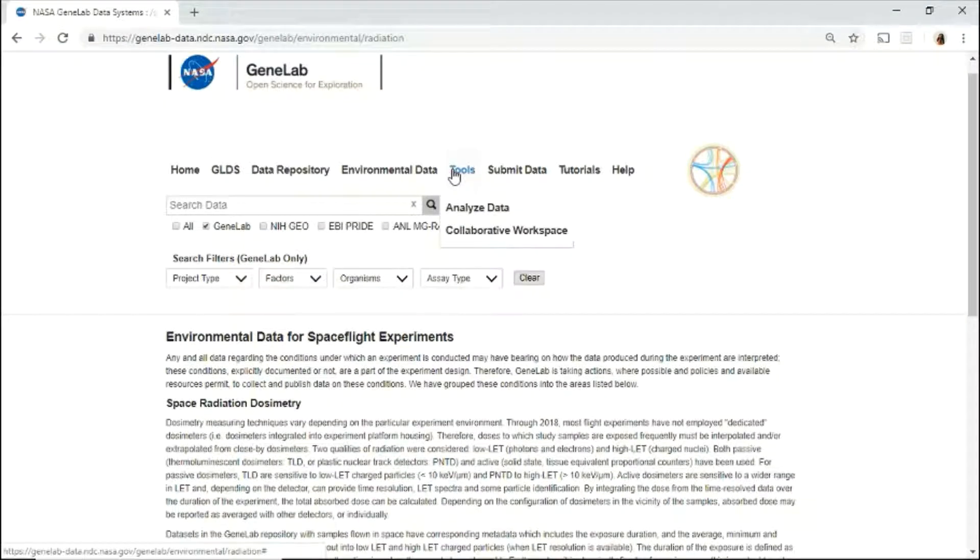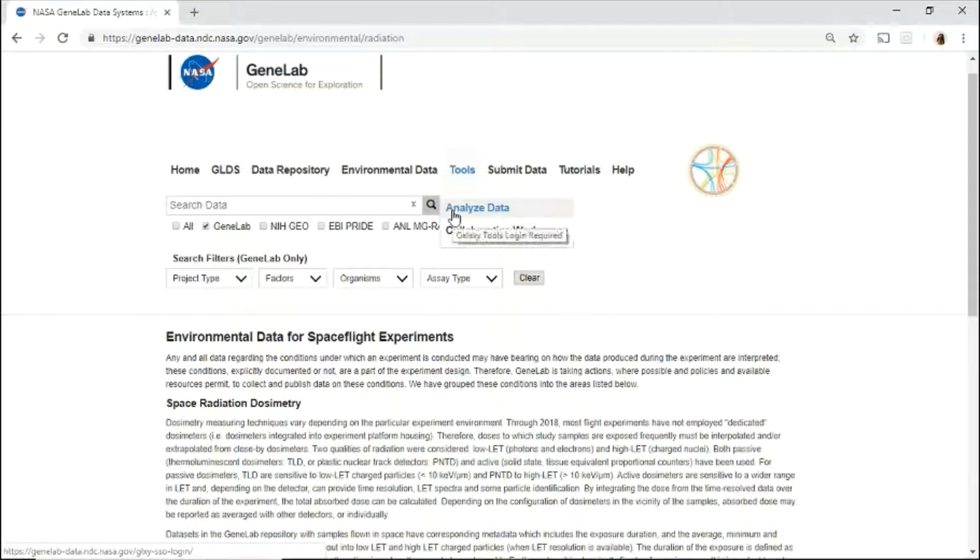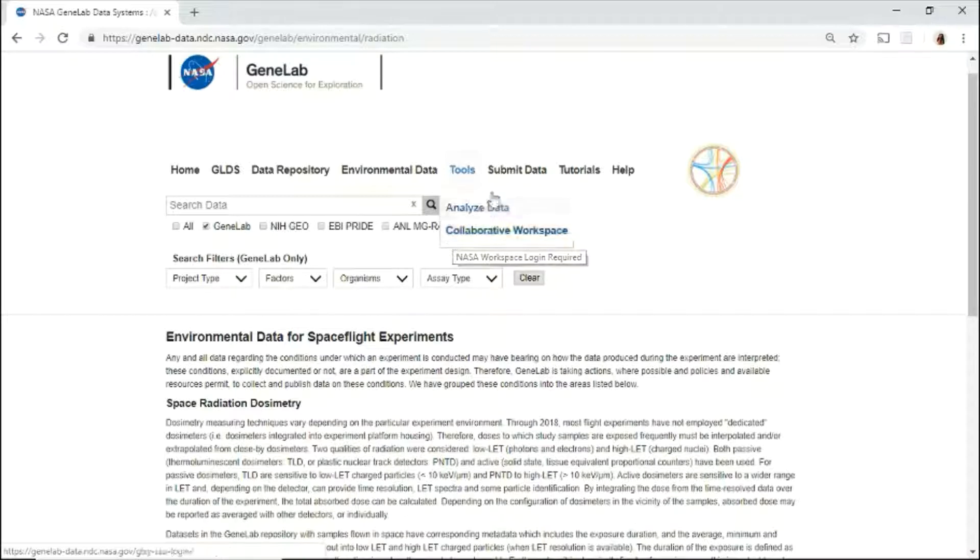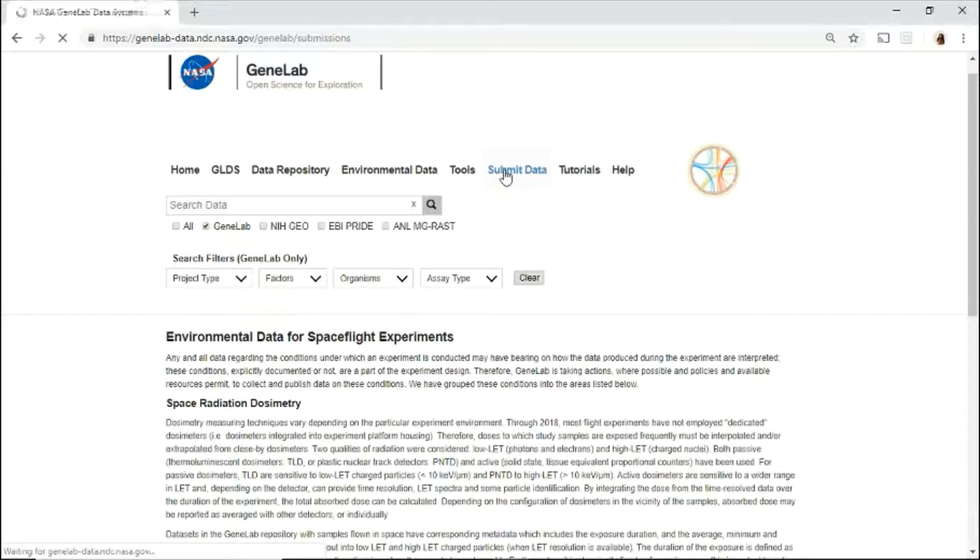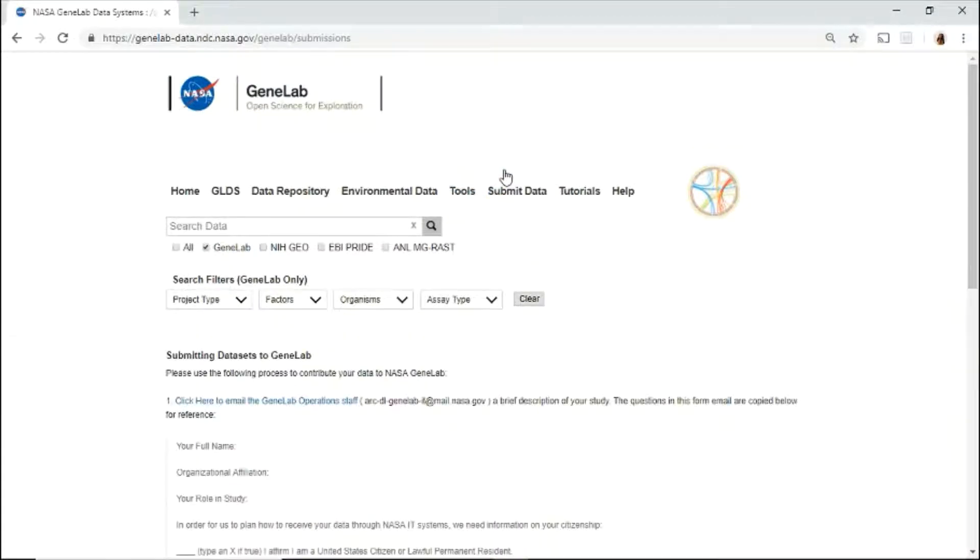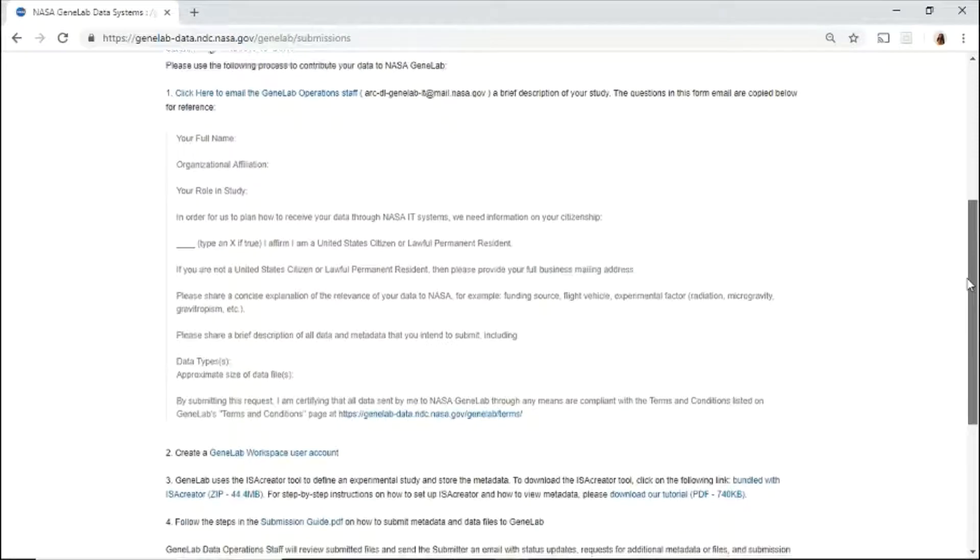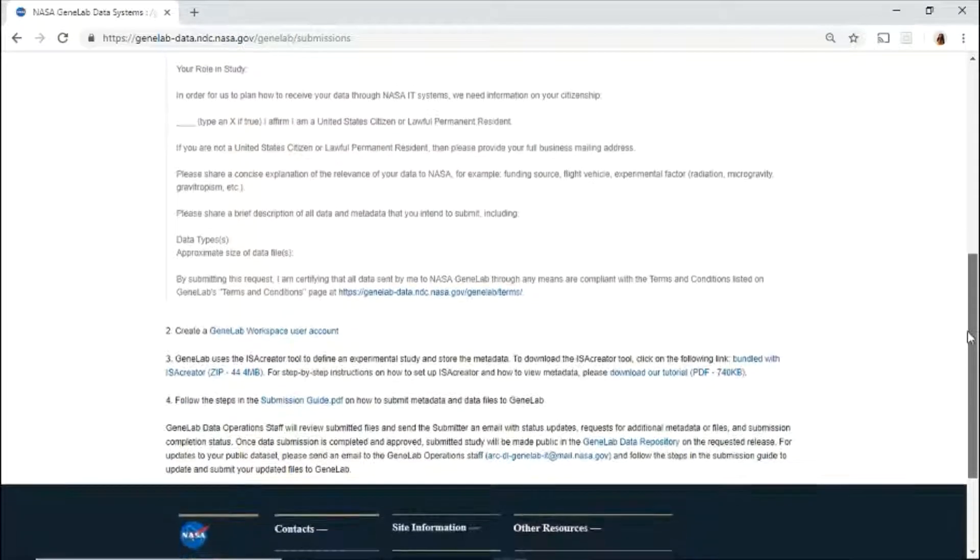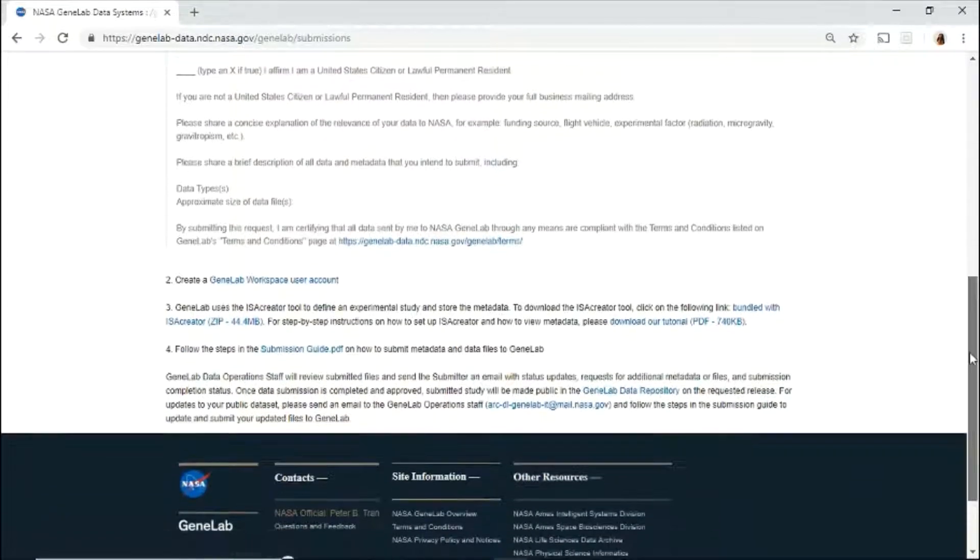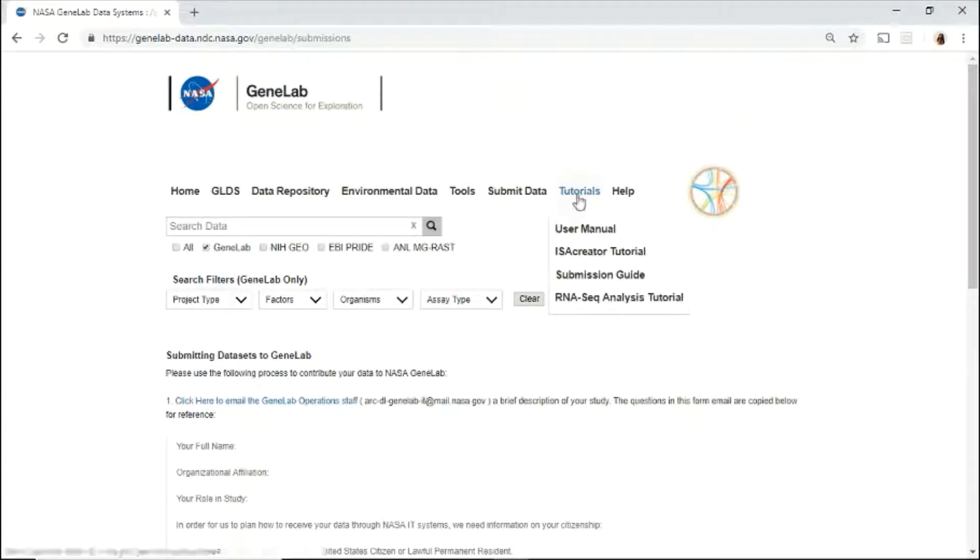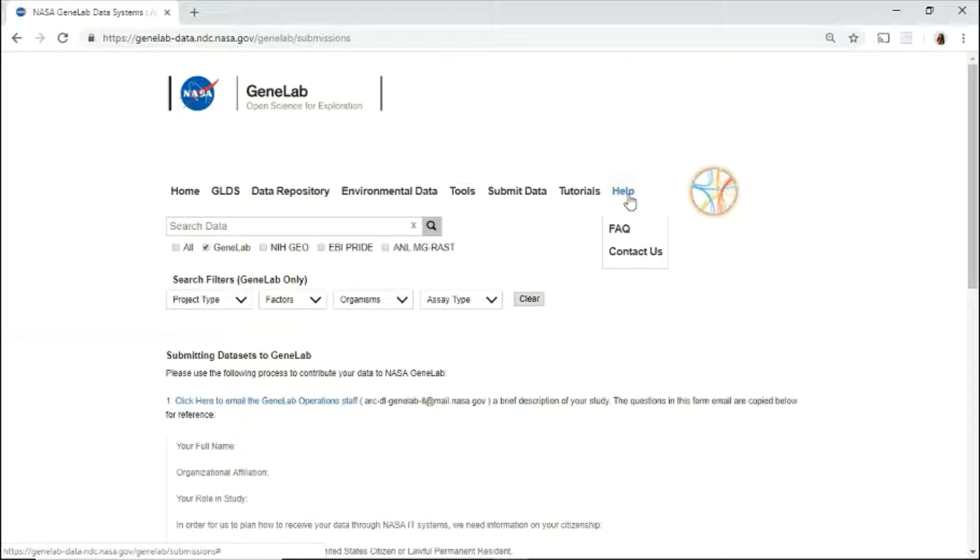Under the tools menu, click to access the analysis platform to analyze omics data, or the collaborator workspace to upload, store, and share files. If you have space-related omics data, use this page for step-by-step instructions on how to submit your data. Use the tools and help menu for guidance and contact information.